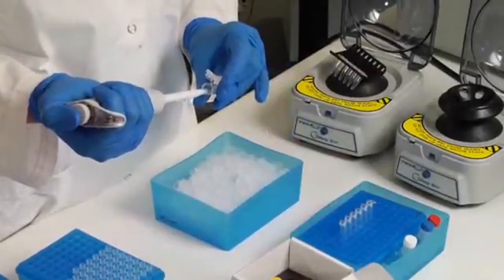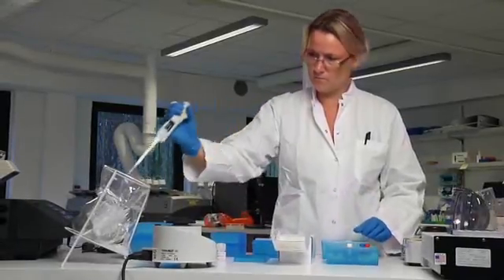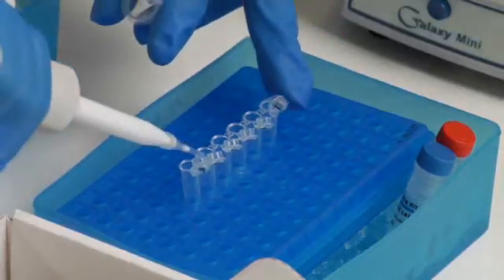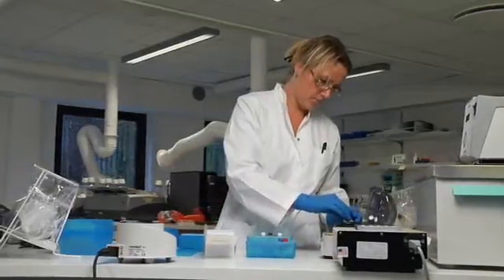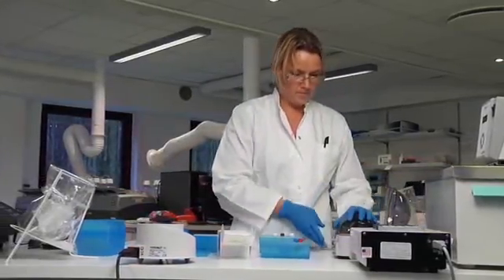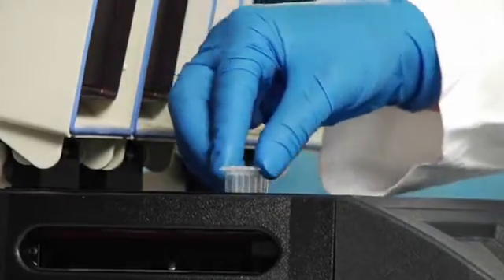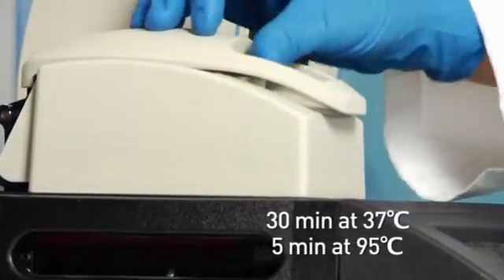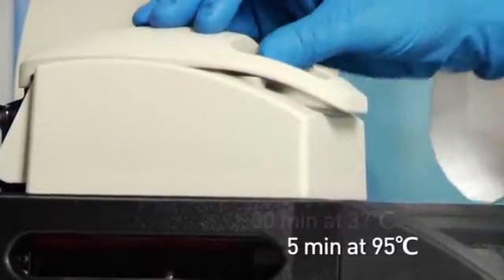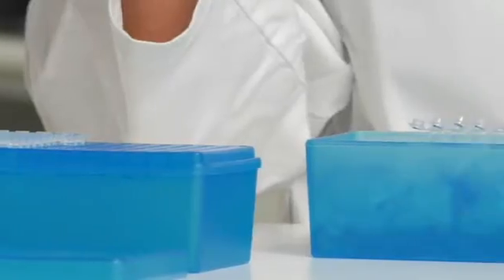Mix SIP buffer, SIP enzyme, and spike-in RNAs. Then add the master mix to your RNA samples and spin down the contents of the tubes. The samples are now ready for incubation. Incubate at 37 and then 95 degrees in a thermocycler. The samples should then be snap-cooled and put on ice.